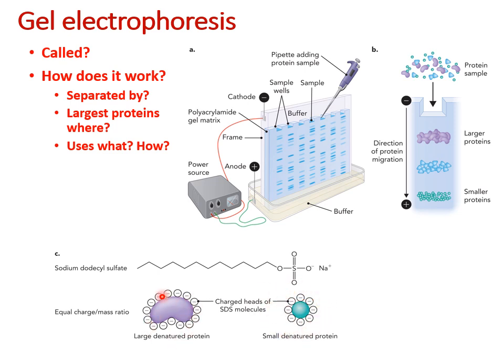Now notice they're denatured ahead of time to help you run them through the sample. So, the buffer that you have them in, you will be using to denature them. The SDS will also help denature them as well. It's going to be important because it's coating them with a negative charge. Okay, so the purpose of SDS is to be a detergent that adds a net negative charge to the protein.